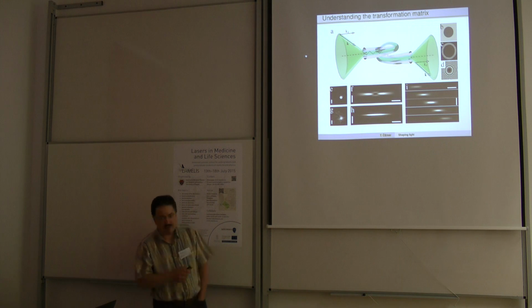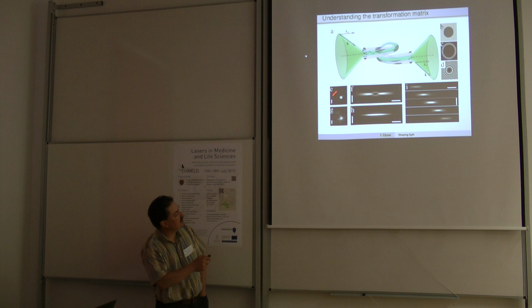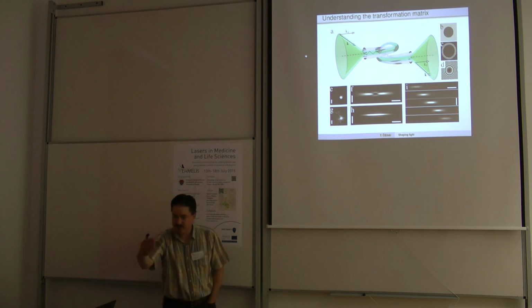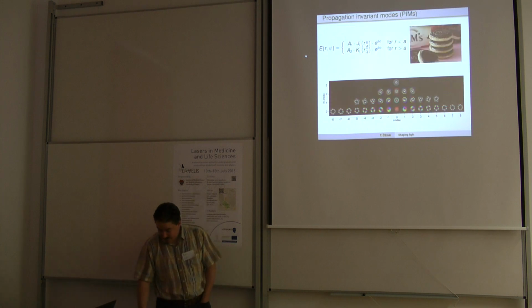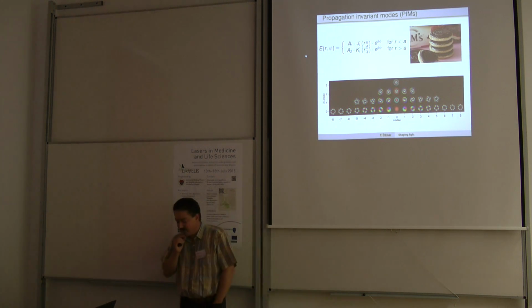You can use it, for example, to convert your diffraction limited point into a donut mode, just by using this azimuthally independent modulation, because whatever is azimuthally independent works exactly the same as if the fiber was a Fourier component. Right? So you can create a donut shape, you can create a Bessel beam as well, just by filtering one of these zones, again, which is quite nice. And you can use a defocus to shift the beam in and out from the fiber, right, without any recalibration. It's also quite cool.